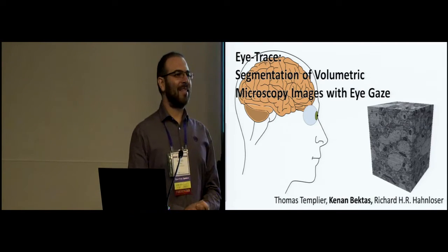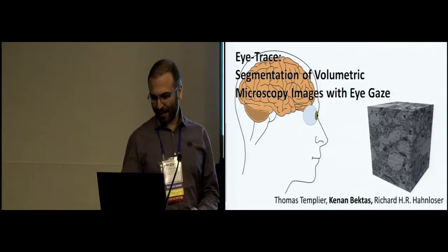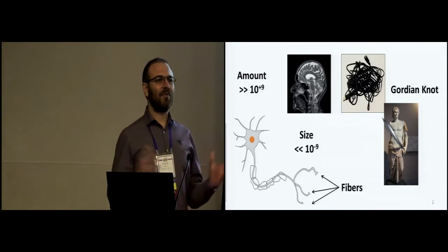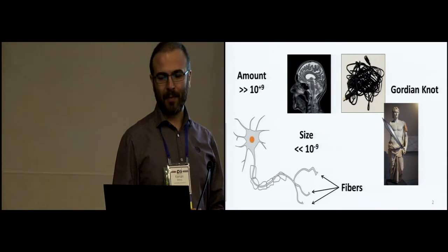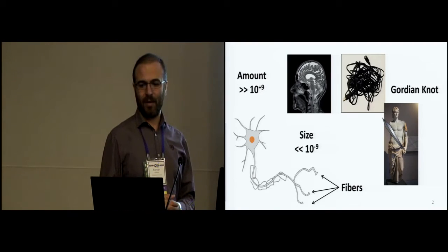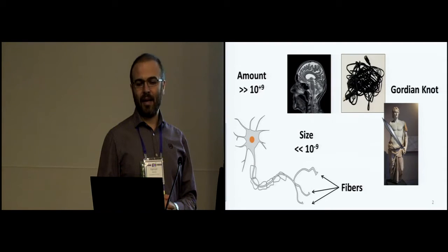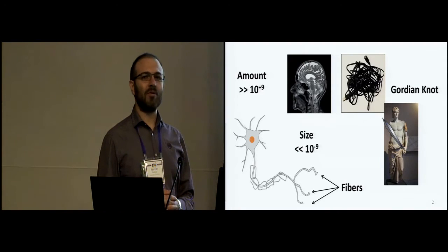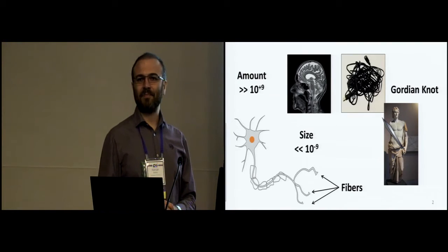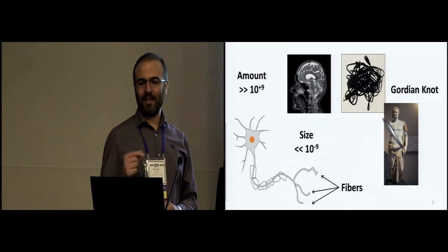Have you ever wondered how our brain is structured or wired? Our brain is composed of billions of neurons and fibers. These neurons and fibers are responsible for transmitting electrical signals among each other. They constitute a sort of cable salad at nanometric scale. Can you imagine tracing a single wire in this cable salad?